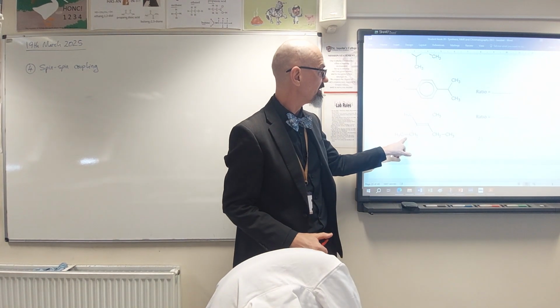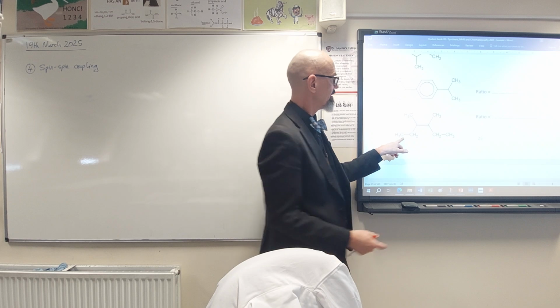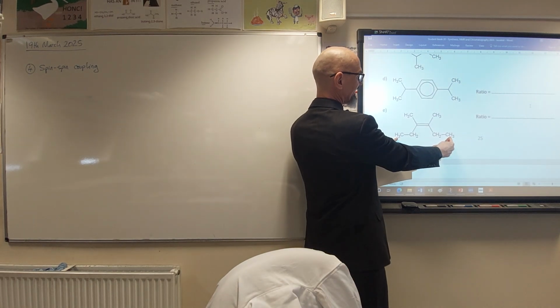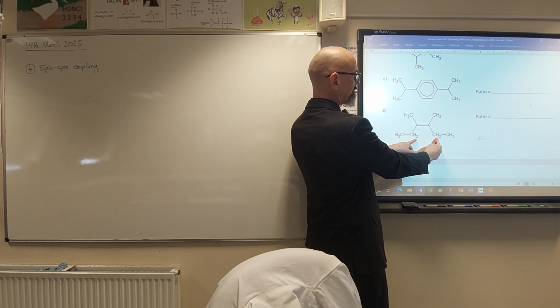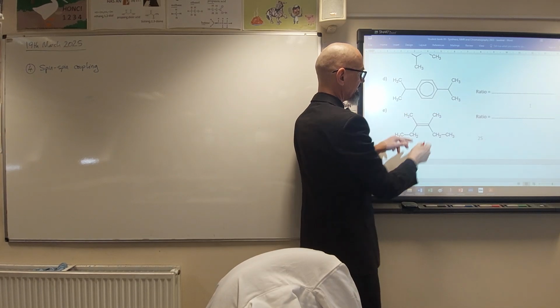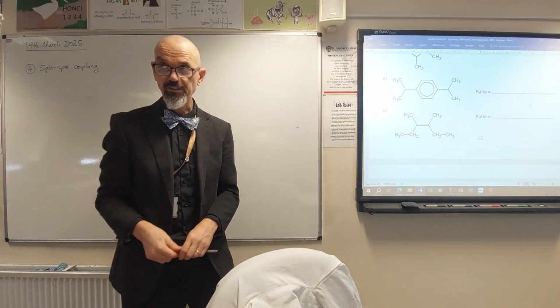Okay, and the last one, 2 CH3s, so that's 6 there, and then those 4 are all the same. So we've got 6 to 4 to 6, 3 to 2 to 3.